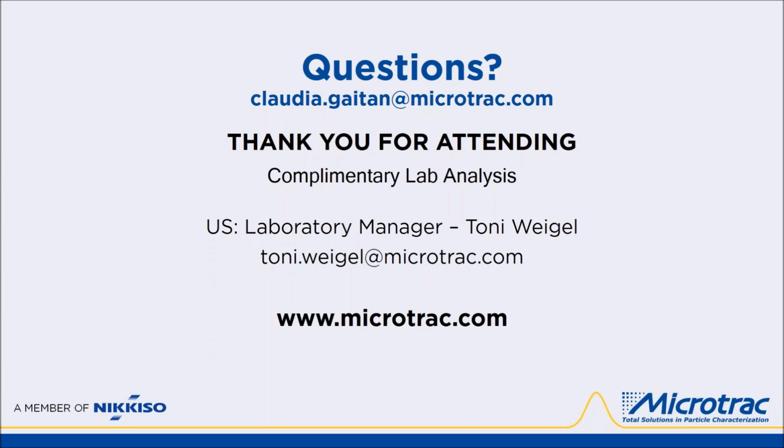What is the total measuring time for both analyses? I would say that 90% of analyses can be completed very easily in less than 10 minutes, often less than 5 minutes.